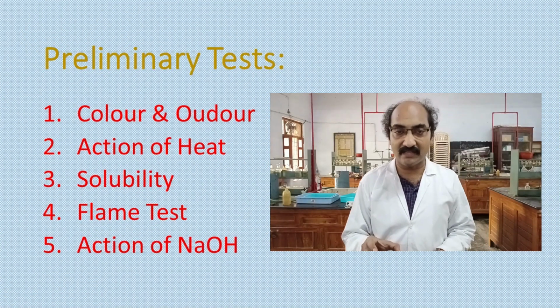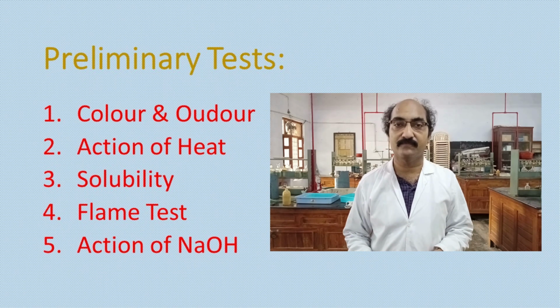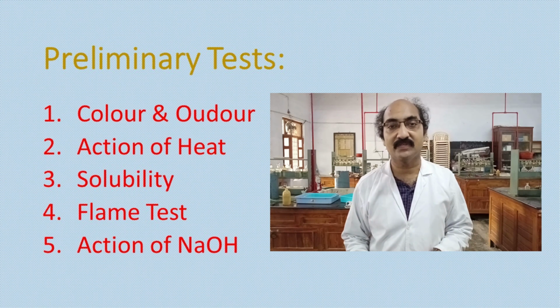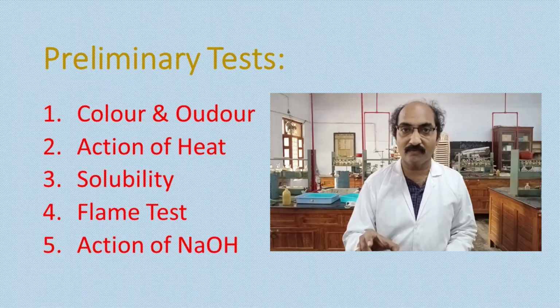For the systematic analysis of any salt mixture, we need to perform preliminary tests first. What are the preliminary tests? The preliminary tests include color, odor, action of heat, flame test, and then action of NaOH. Let us see all these tests one by one now.